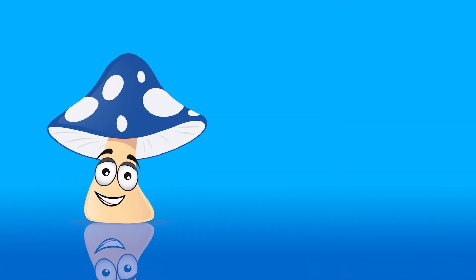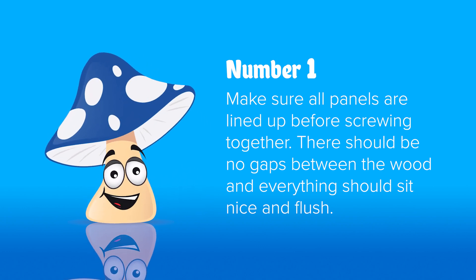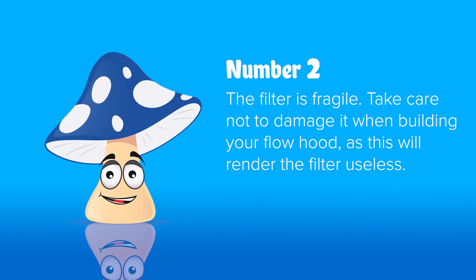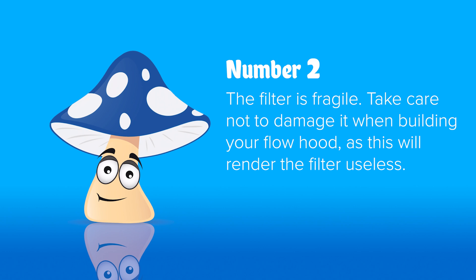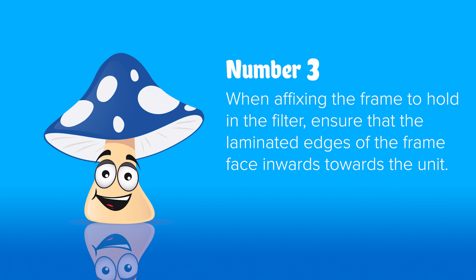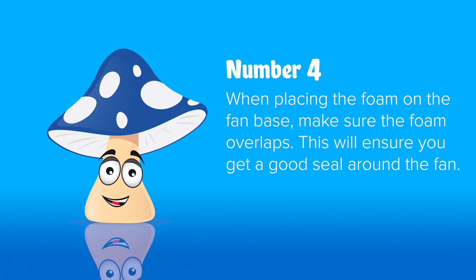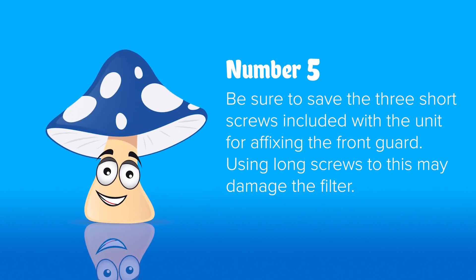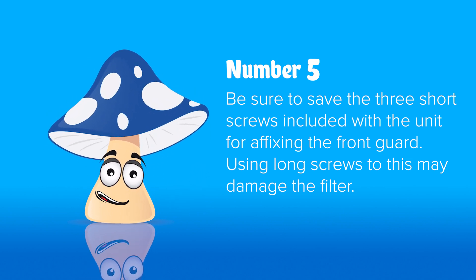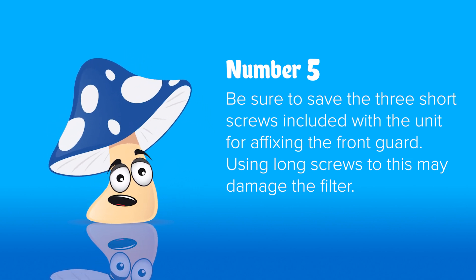Tips for building your flow hood. Number one: make sure everything is lined up correctly before drilling in each screw and that there are no gaps between the wood panels. Number two: be careful not to damage the filter when building the unit, as any damage will result in the filter not functioning correctly and could potentially contaminate your work. Number three: when affixing the filter frame, make sure the laminated side goes inwards to the unit. Number four: when installing the fan, make sure the foam overlaps to ensure a good seal around the fan hole. Number five: remember that the long screws are for the main filter unit construction, and the short screws are to affix the front guard — don't use the long screws on the front guard or they will go through the wood and potentially damage your filter.